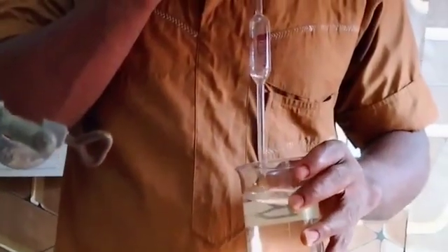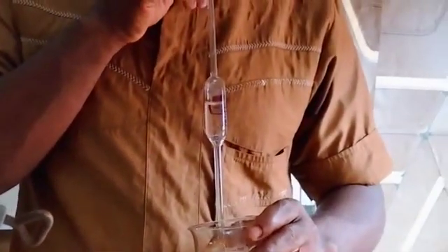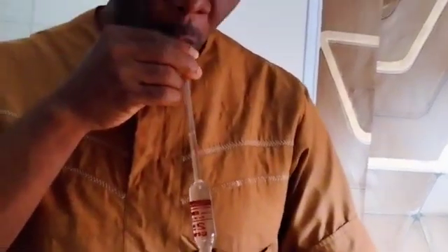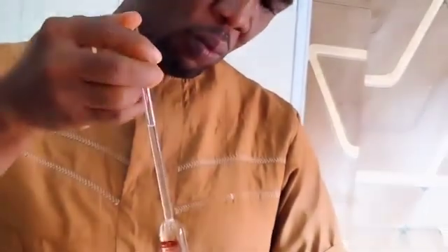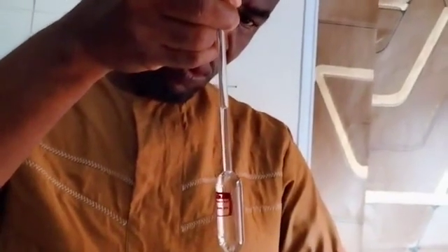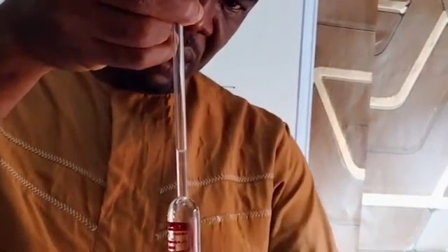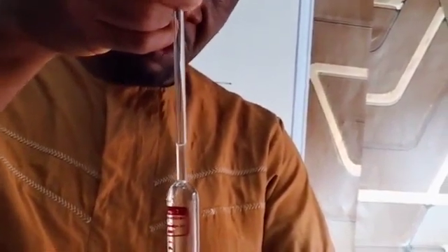Then we prepare the alkali. You can see it going down gradually to the meniscus, to the ring. We'll stop there.